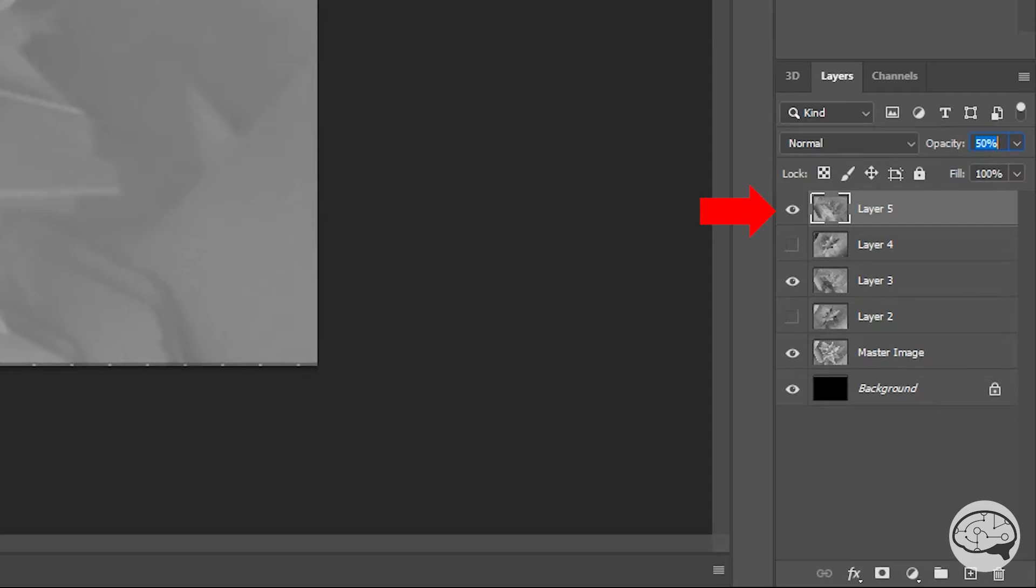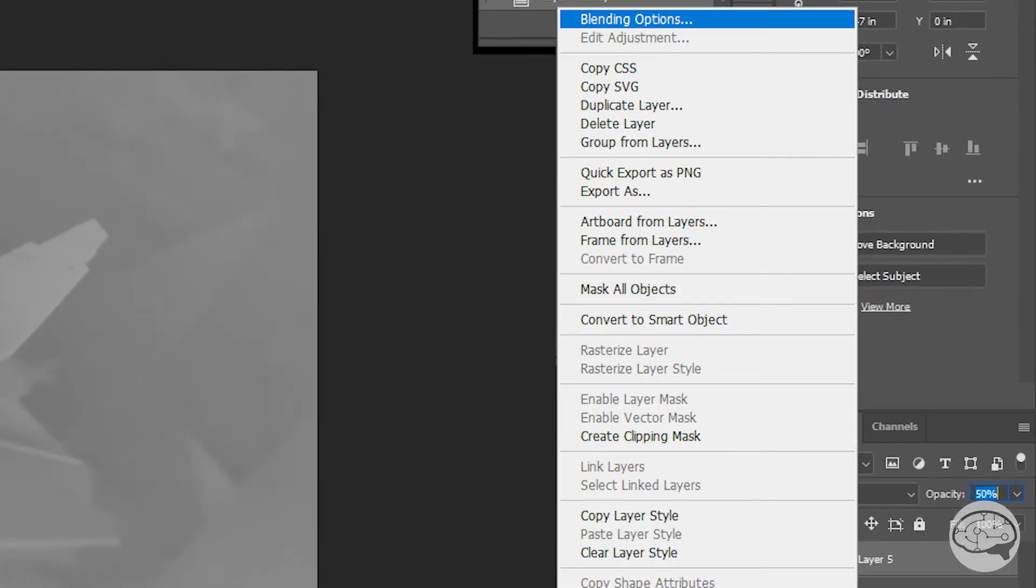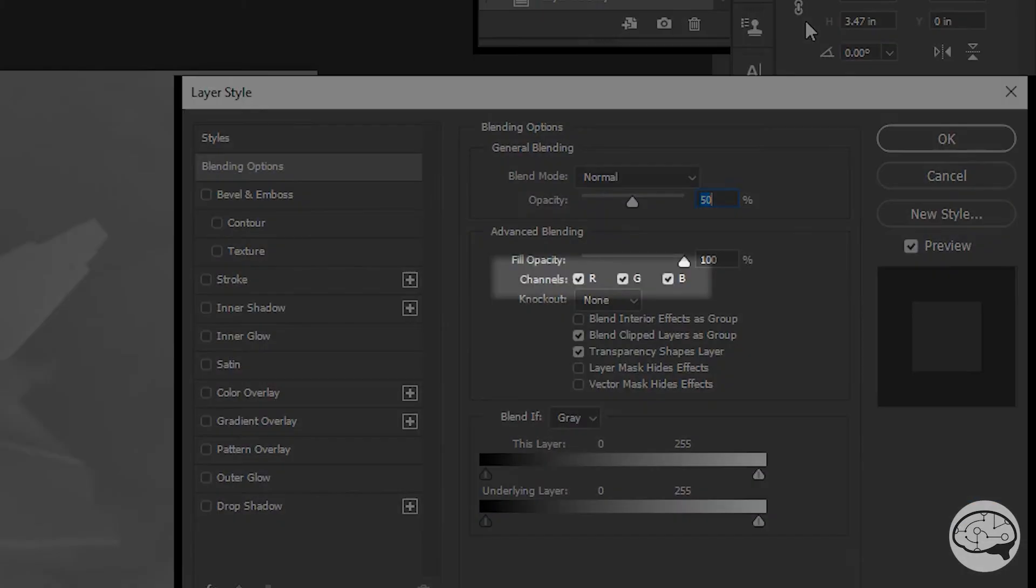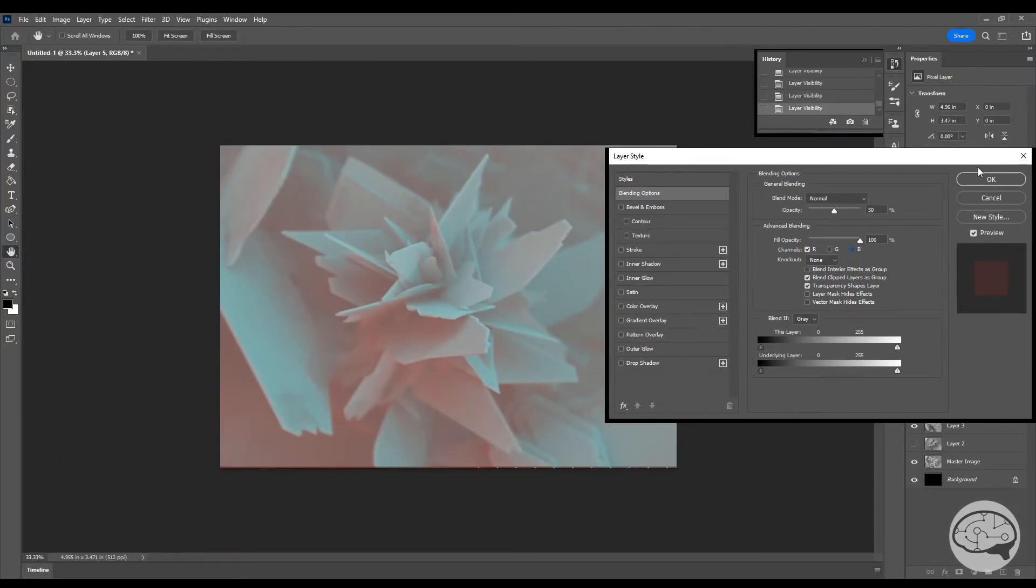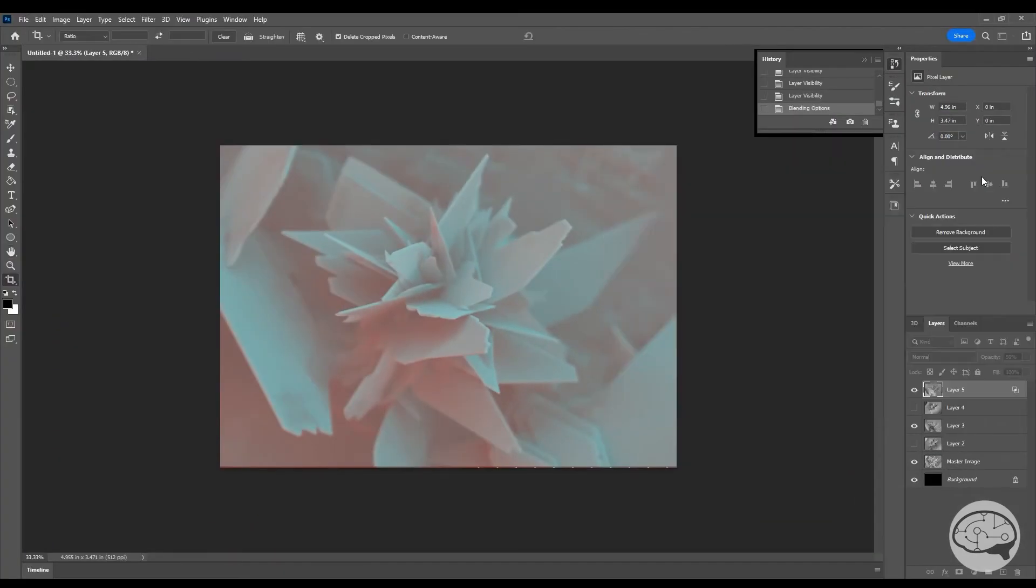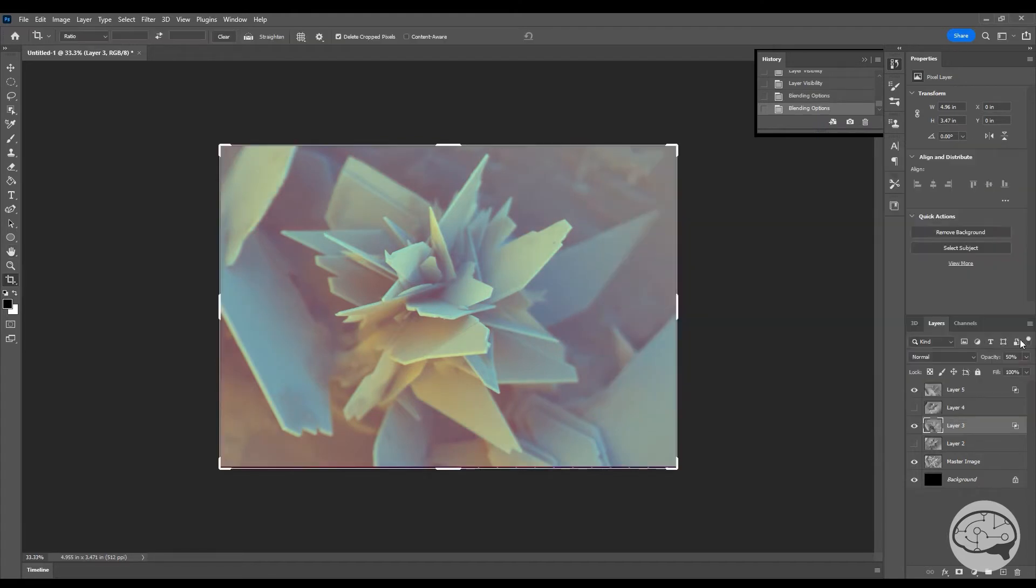To start the colorization, we'll right-click on this layer and go up to the very top and select Blending Options. Right here in the center are three check boxes for red, green, and blue. We'll uncheck two of them, and it doesn't matter which two. We click OK, and we can see some crazy stuff is happening on our image. We'll then do the same with the other layer we decided to use, but this time we'll choose a different color to leave checked.